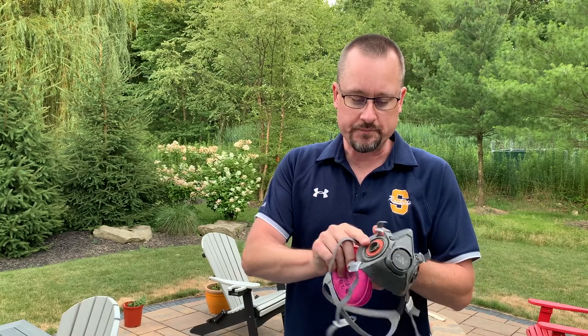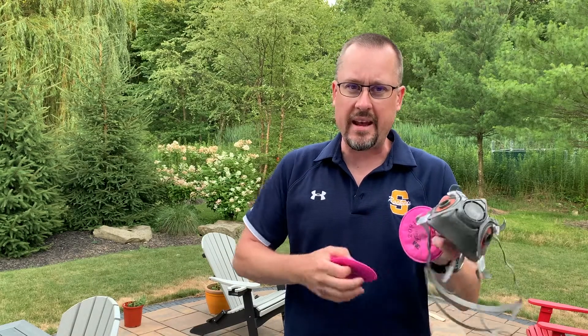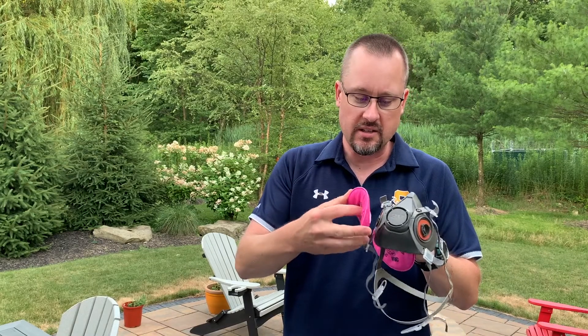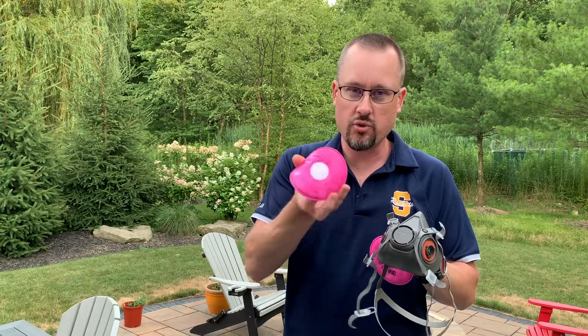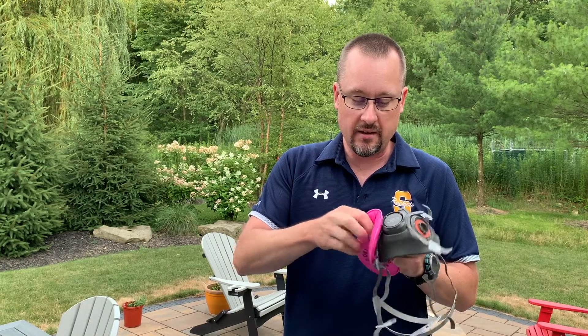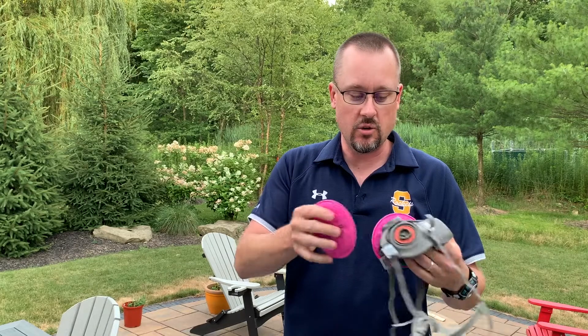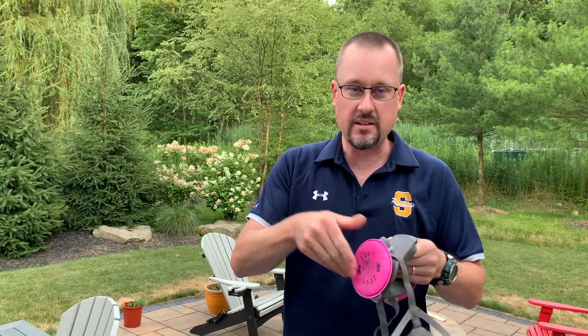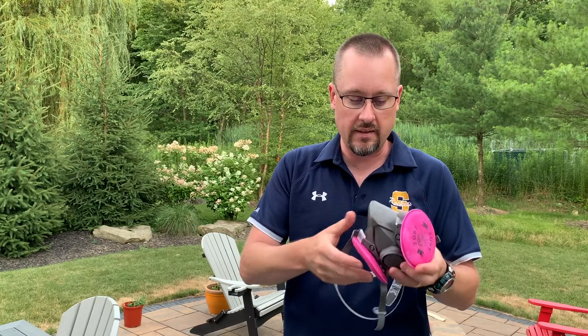Here's how that works. They have what's called a bayonet fitting, so they only go on in one way and they go on a clockwise fitting. You line up — there's little grooves in the filter and there's little knobs on the mask itself. So you kind of push in and then rotate clockwise. You do the same thing on both sides so that they go on. And to take off, you do the other way. That's what the filters look like on there.